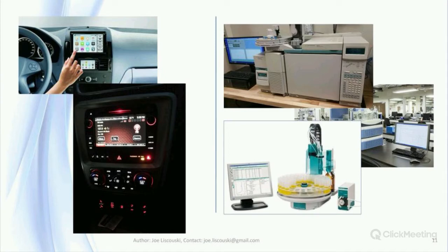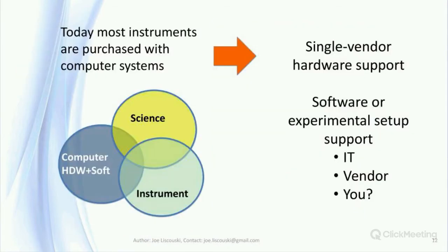They could handle basic maintenance, but didn't have the education to diagnose overall systems issues. The instrument system vendor would support their equipment, but when an experiment moved into coordination of multiple components, the users had to do a lot of the troubleshooting themselves. When we combine instruments, science, and computer systems, there are several areas where it would be difficult to diagnose problems and figure out what needs attention.